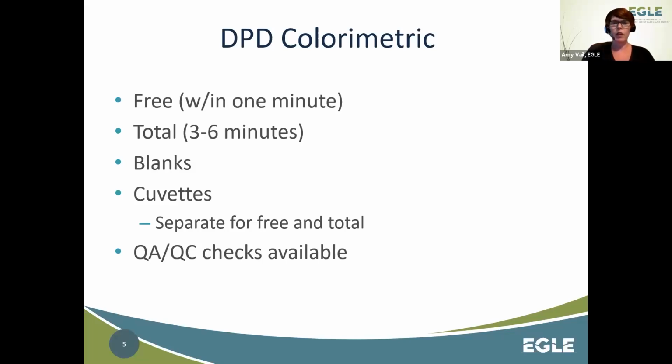They come factory calibrated and you can use them so many times. I think for the colorimeter, they say about 5,000 readings, and they're good for that. And then you pretty much buy a new one most of the time. So you can check to see how well those calibrations are still holding.